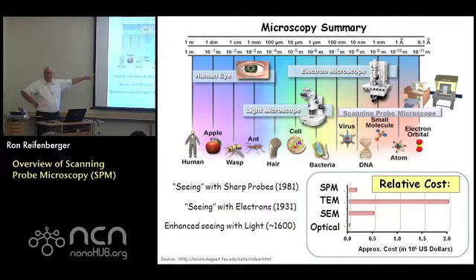And the advantage of the scanning probe microscope is that it's reasonably accessible. If you spend a few weeks of your time to learn how to use it, usually you can get access to it, okay? So it sort of bridges the gap between the optical microscope, which is everywhere, and these transmission electron microscopes and scanning electron microscopes, which tend to be localized in user-oriented labs, okay?